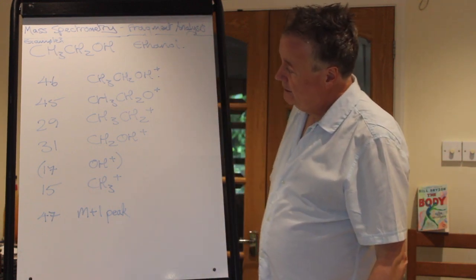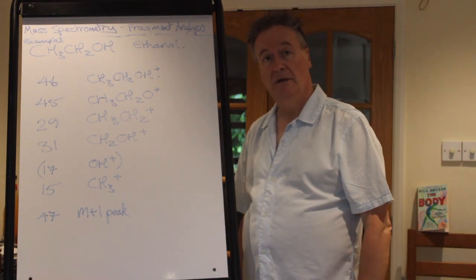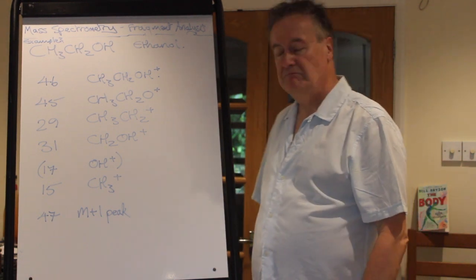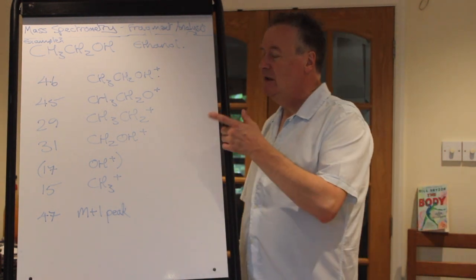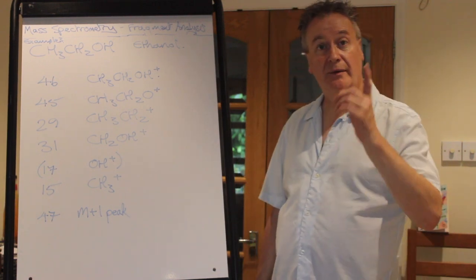So that means there were 1, 2, 3, 4, 5, 6, 7 to identify. How many did you get? Well, hopefully most. You did quite well if you got most of them for your first attempt. So we're going to have another go with another chemical. So you need to get the board ready for that. I'll see you in a moment.